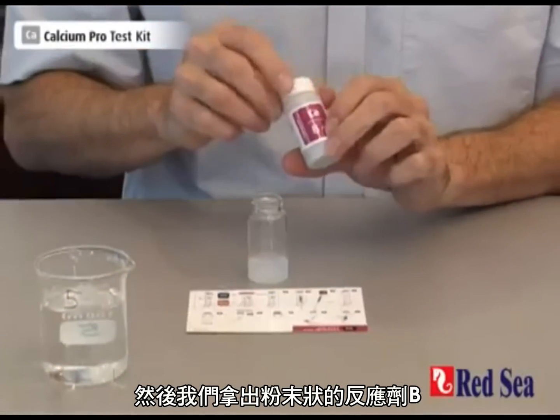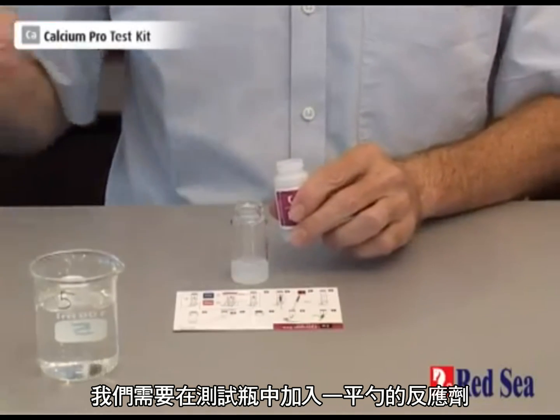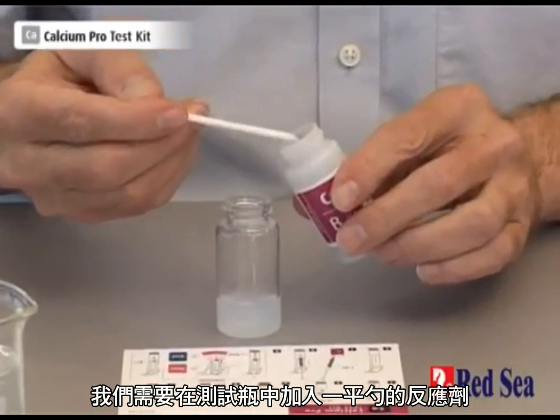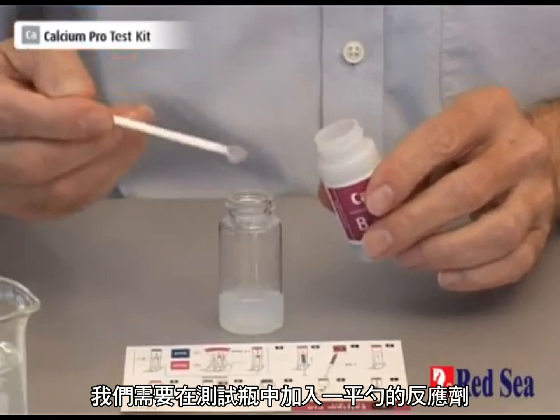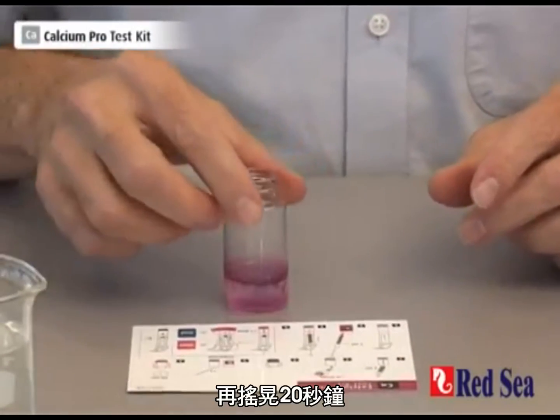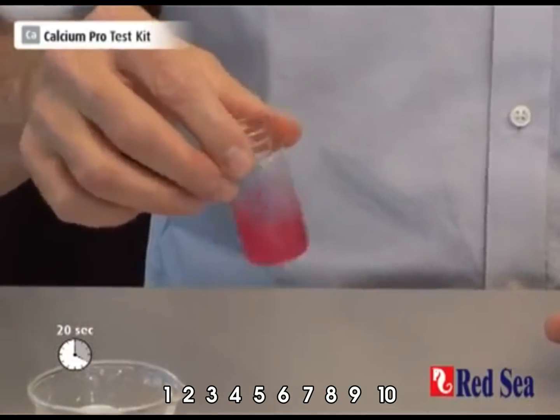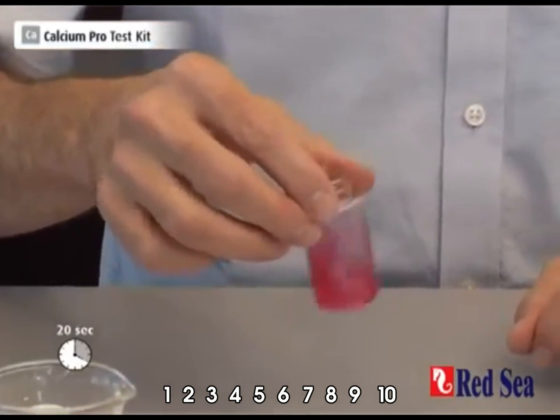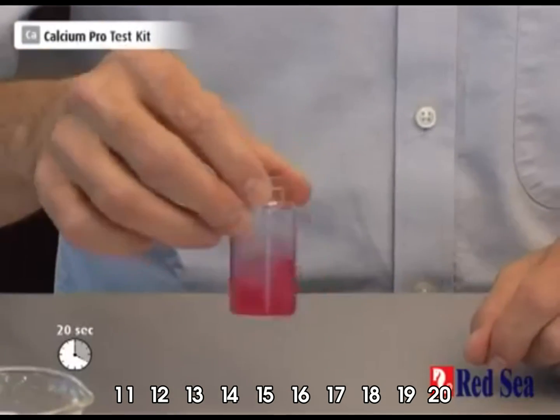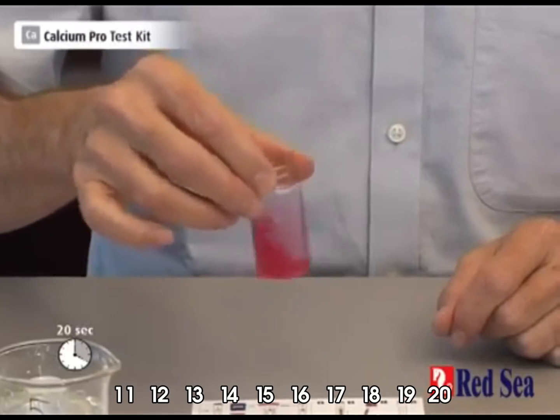We then take our reagent B, which is a powder, and we have to put 1 level spoon of reagent into the vial. Then we shake for 20 seconds, counting from 1 to 20.